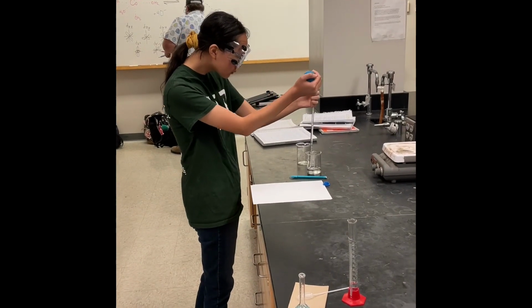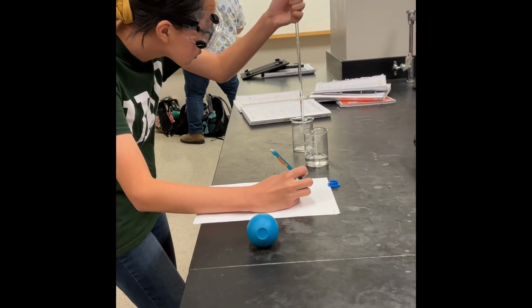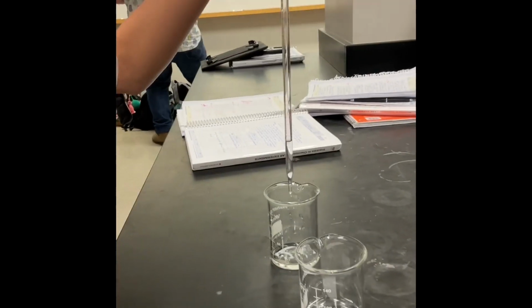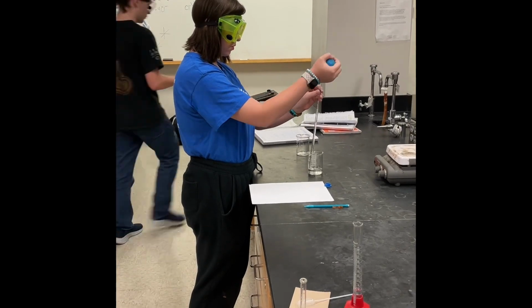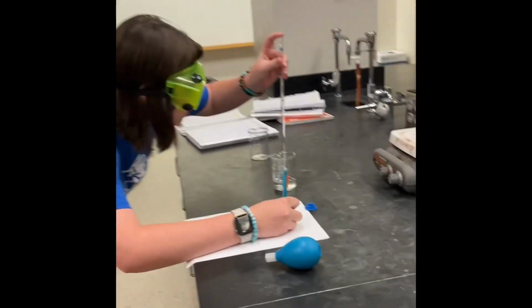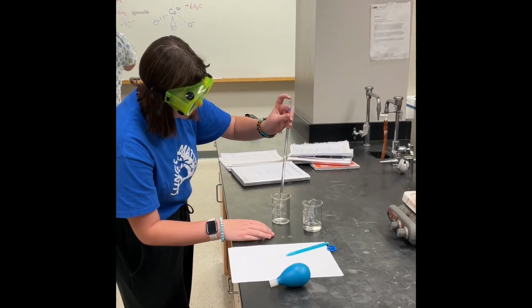Rinse the graduated pipette with the stock solution to decrease the amount of contamination in our calculations. Using the bulb, pull stock solution into the graduated pipette. Record the volume extracted based on the bottom of the meniscus, estimating one more decimal than is definitive, in this case to the 10th, and transfer to a new beaker whose mass has already been recorded.